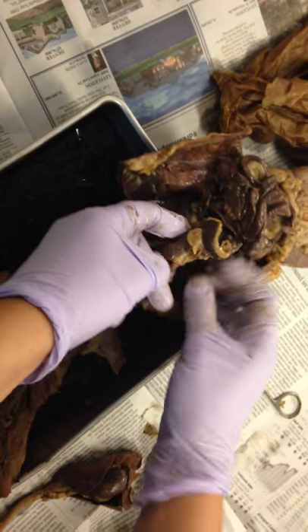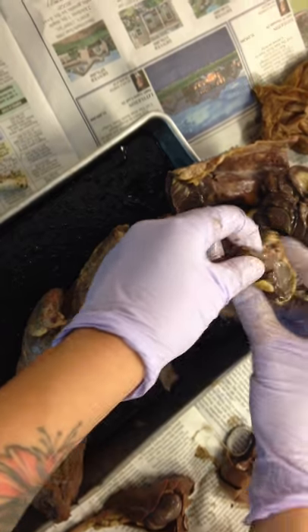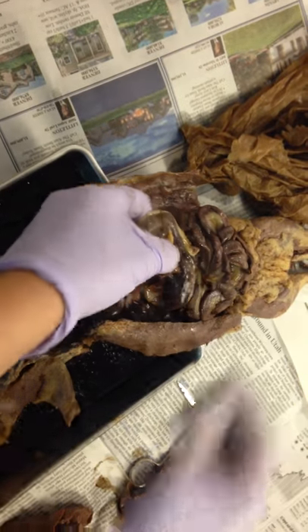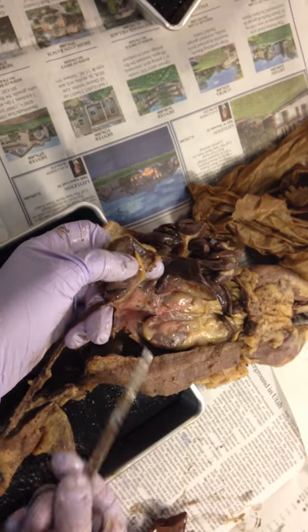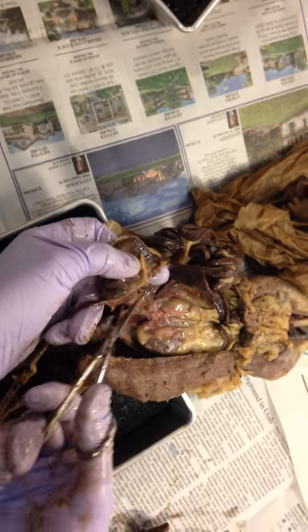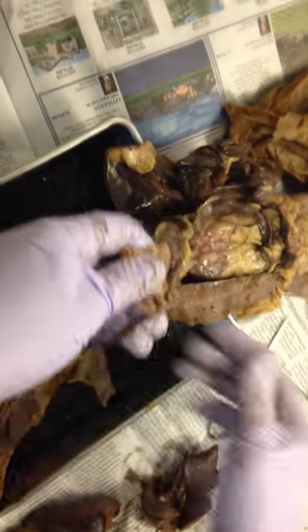Okay, so now that I've removed that, now I can get into the cool part. Now I can see really well that my esophagus is directly connecting to what? The stomach. Now I can also see, if I look behind here, do you see how it's still connected? So I've got some muscle and tissue, so I'm going to gently move that over and separate that a little bit. So now I've got esophagus that leads into stomach. I've still got some greater omentum on there that I can remove.